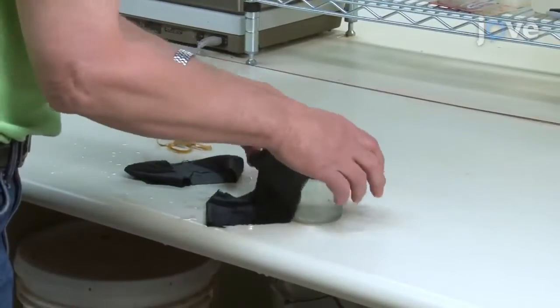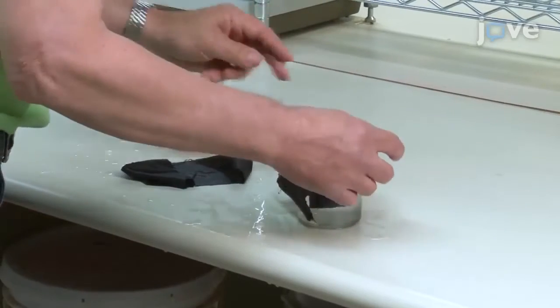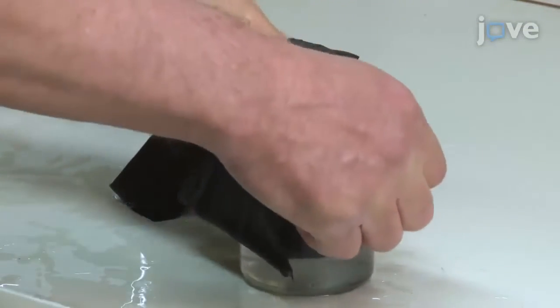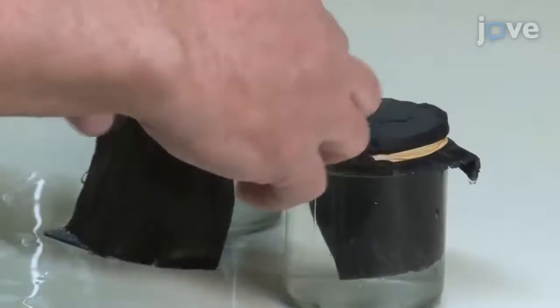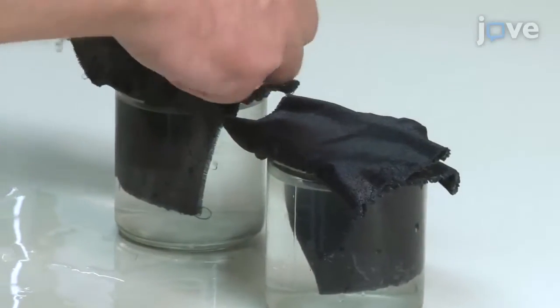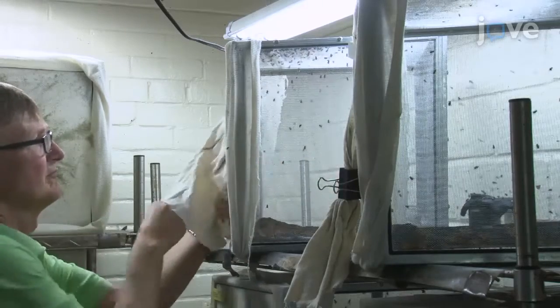Dip the tip of a cloth into a 250 milliliter jar filled with 40 degrees Celsius water. Then wrap the cloth around the outside of the jar and secure the cloth with a rubber band. Fold the loose end of the cloth over the top of the jar to limit access to the water. Now place this cup into a cage of 8 to 10-day-old flies.